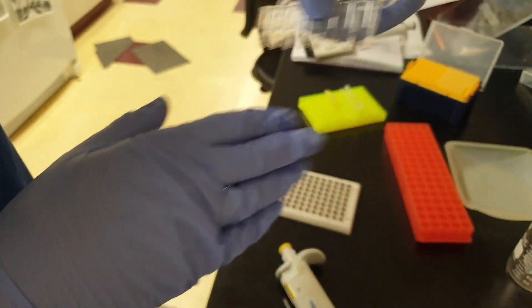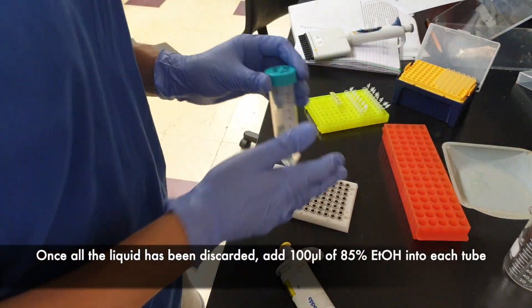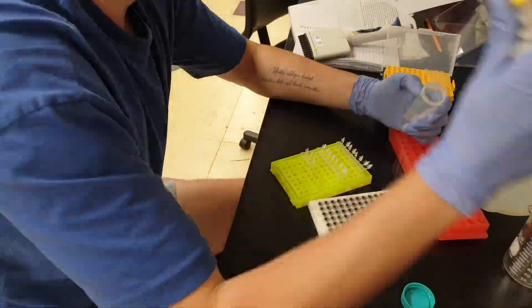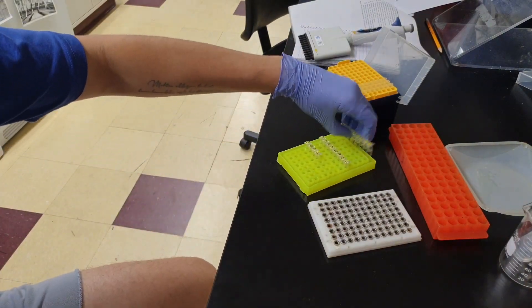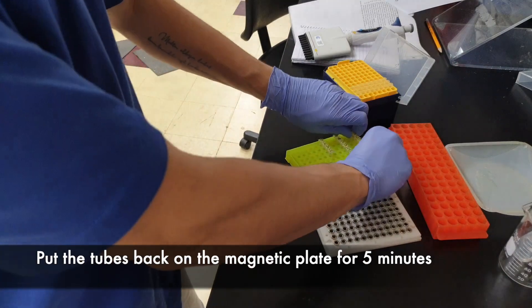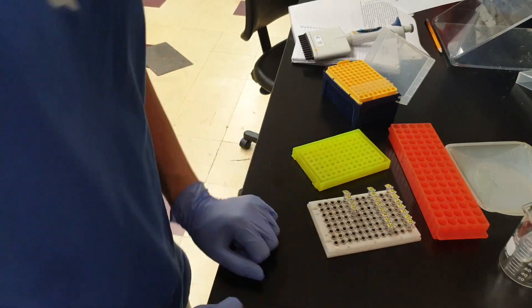I've removed all of the liquid from the tubes. Now we're going to grab the 85% ethanol again and add 100 microliters into each tube. Now that's done, let's vortex these again, then put them onto the magnetic plates and wait 5 more minutes.